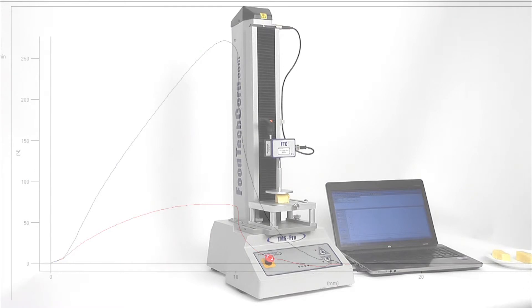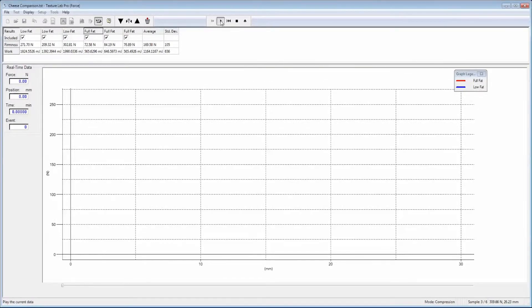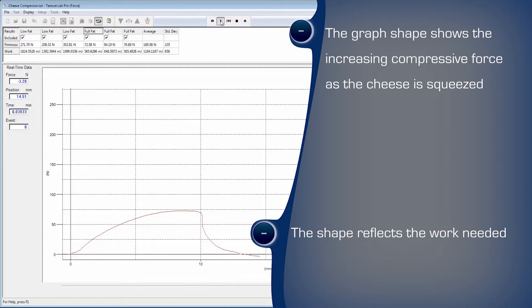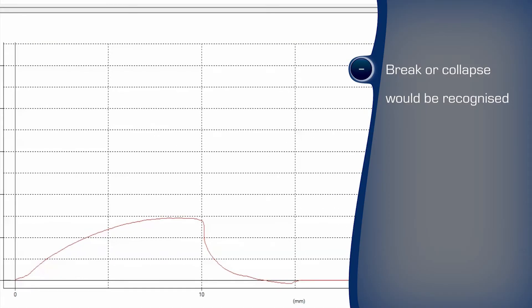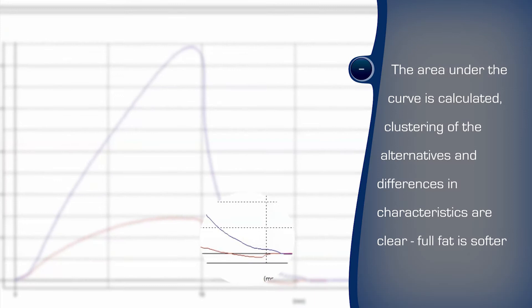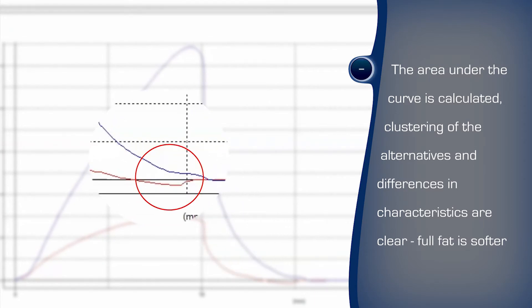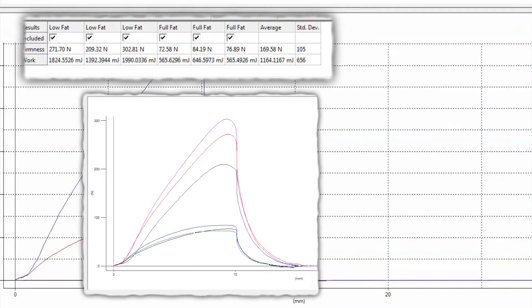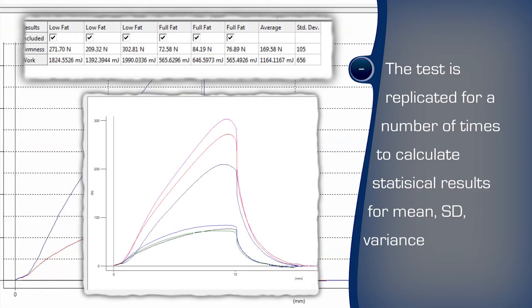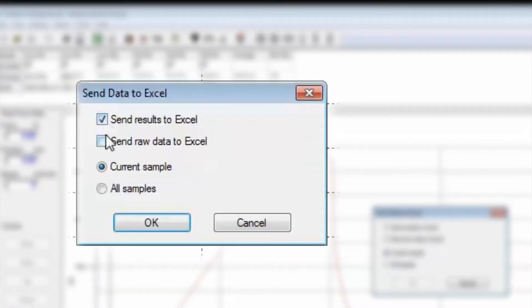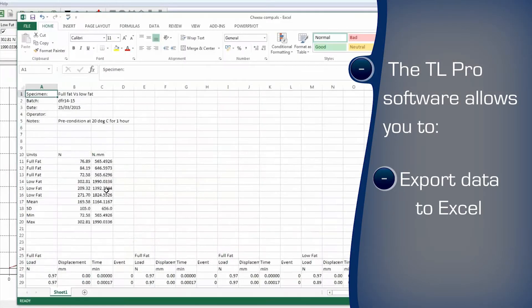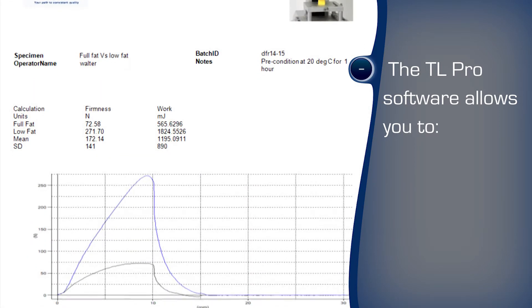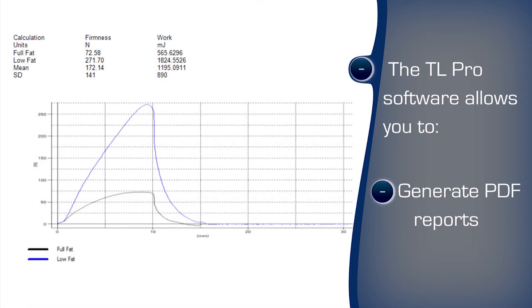The touch screen controlled texture analyzer runs tests at the push of a button with minimal training, ideal for production areas. The test procedure will lower the platen to detect a touch on the sample and zero the readings. The cheese is then compressed at 500 mm per minute to a deformation of 10 mm and the platen then retracted at the same speed back to the zero position. Real-time graphing clearly shows the behaviour of the sample under test. Should the drier cheese crumble, for example, this would be easily seen. The TL software can export to Excel for further examination and traceability and format the results in a user-customisable report style.